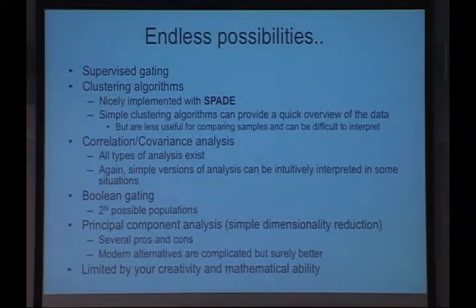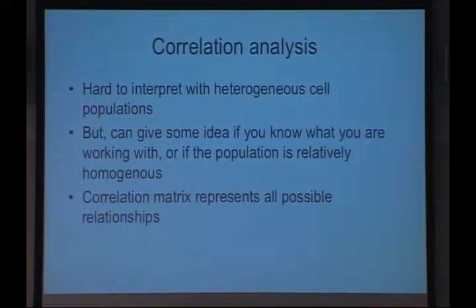So we wrote a simple script to do this, and also to present it in an incomprehensible way, but anyway. And then the principal component analysis. Of course, there are pros and cons here, and I think there is a pipeline of modern alternatives that are going to make this even better that I think, again, some of the Nolan Lab people are working on. And then after that, it's up to you to come up with better ways of thinking about this.